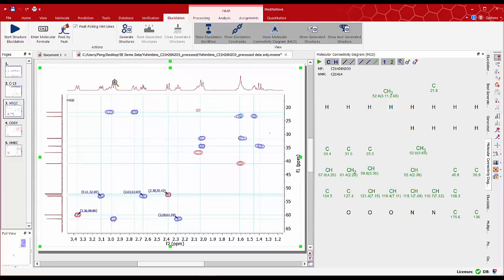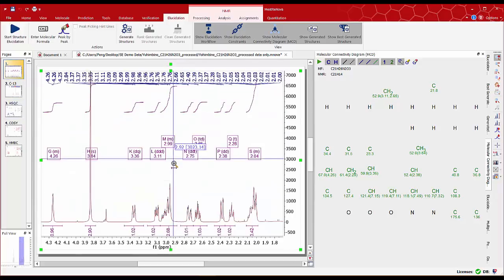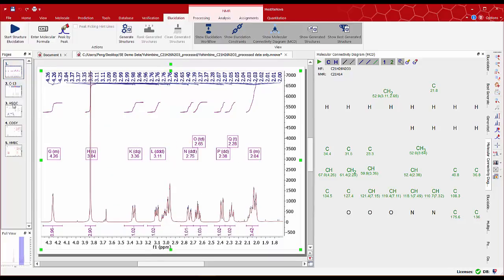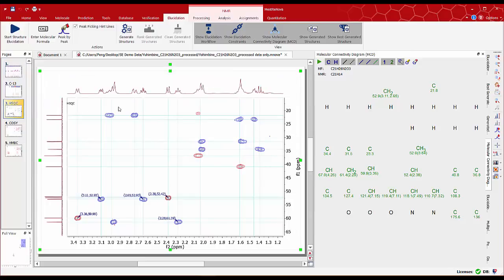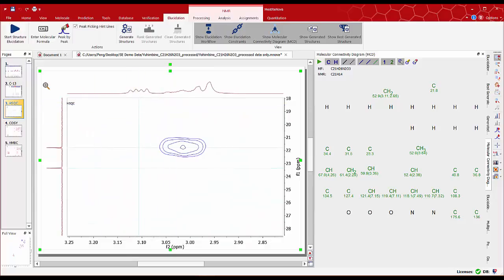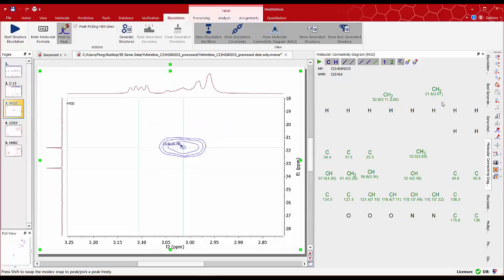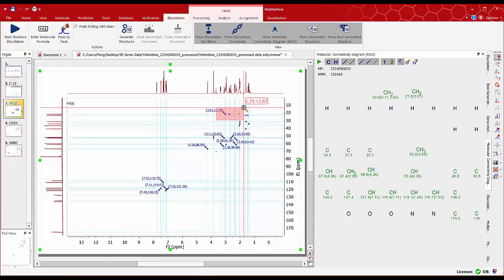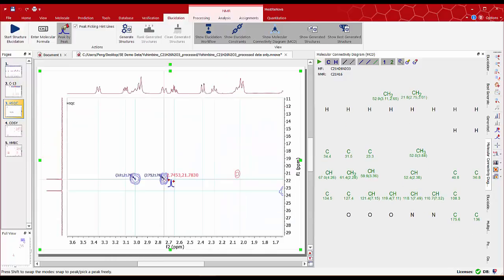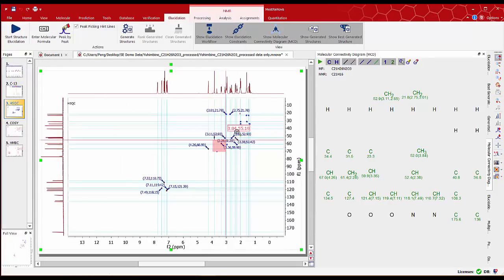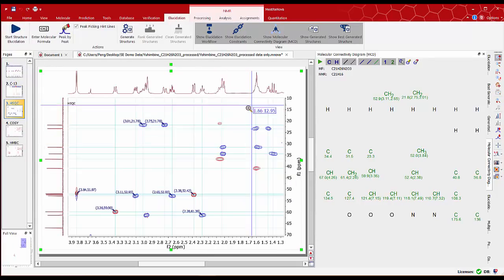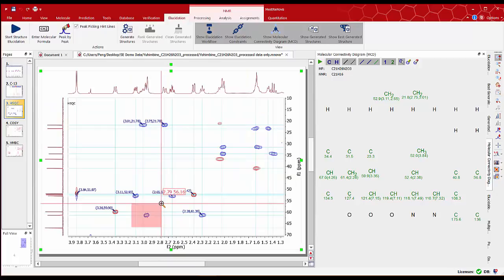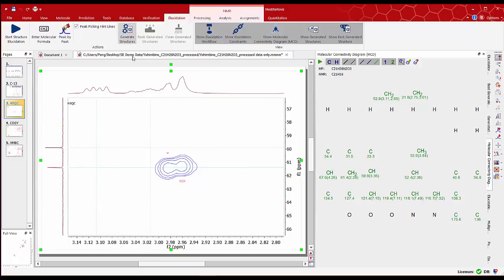We see some more overlap protons. We can remove the integral on the 1D proton spectrum doing mouse right click and select delete multiplet. Then back to the HSQC. Refresh the peak picking hint lines. And do a manual peak by peak analysis as before. We can zoom in now on the problematic correlation. We can click in the center of the correlation at 61.9 ppm.